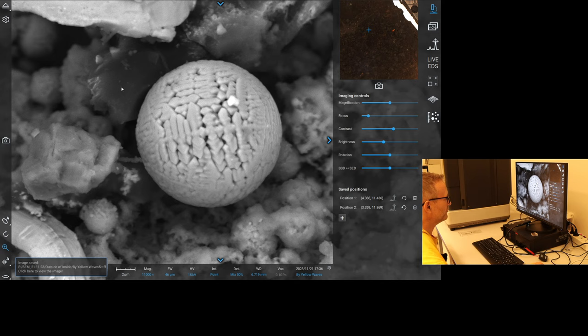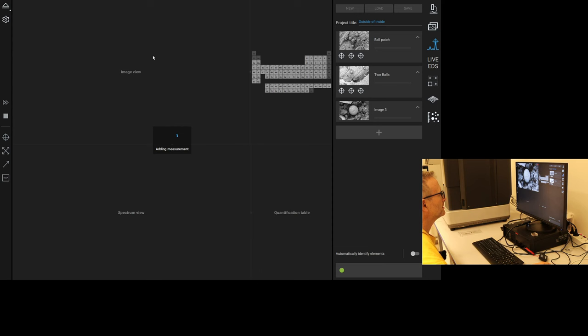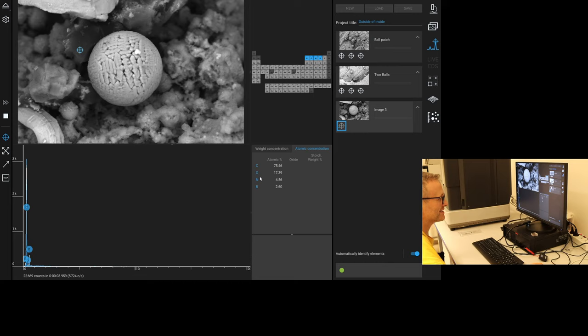So I'm going to keep it. We're on 15 and point. Let's take it in here. Take another shot. I think we'll find, if we can get enough samples in there, that's going to be silicon dioxide. Of course, I've been wrong every other time. No, it's the first option I said. Glassy carbon. Yeah, it's not a diamond, it's glassy carbon.